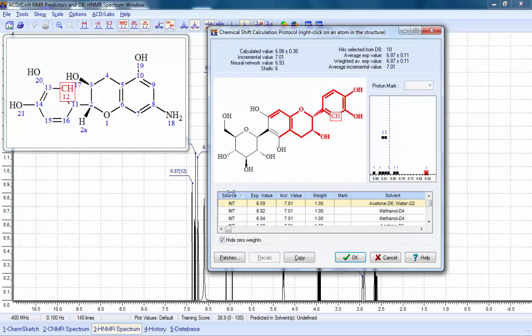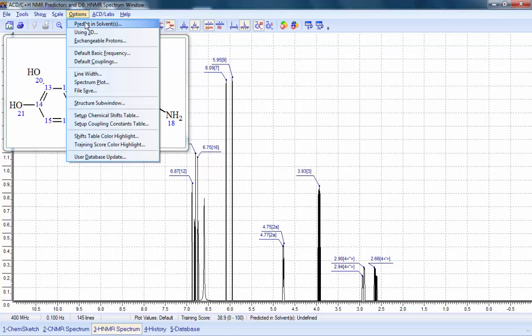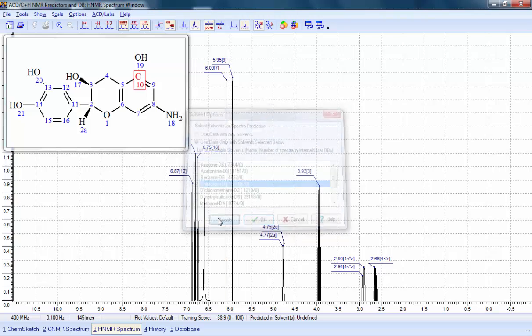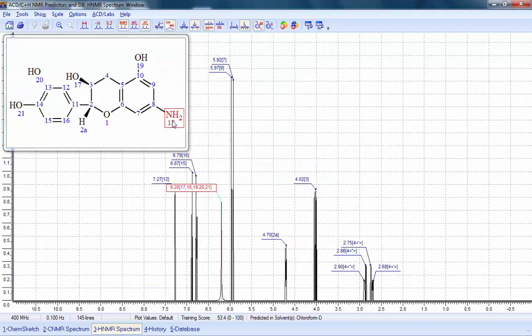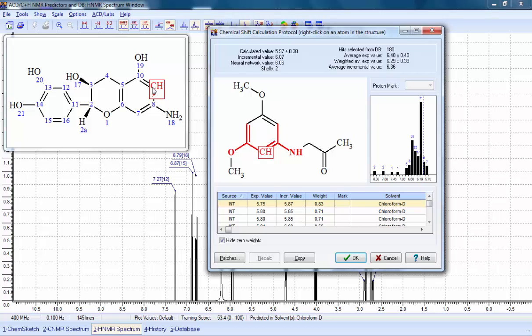If we want to investigate how the data would change in a different solvent, we can easily change that parameter. The software instantly recalculates the spectrum, showing new database records which are specific to the new solvent.